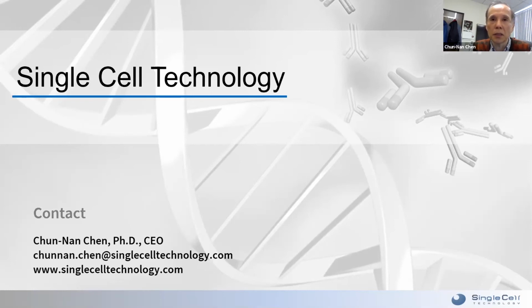And second, because of our sequence recovery rate, if we recover anything from a well with double cells, we'll recover sets of 2: 2 heavy chains and 2 light chains. That may seem not very useful, but sometimes you will look at all of the sequences, and if you see a singlet, a single cell that has a related sequence, then you will probably be able to deconvolve some of the wells that have double cells in them. So we actually do that frequently.